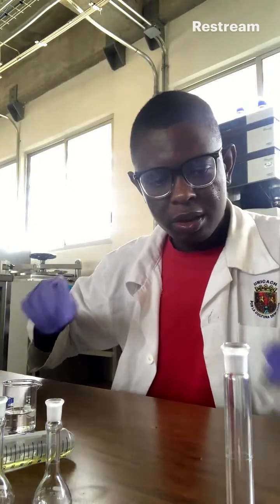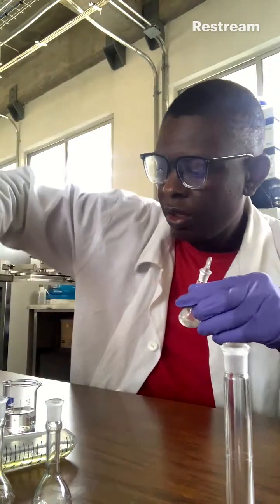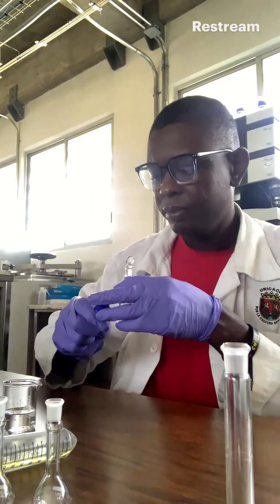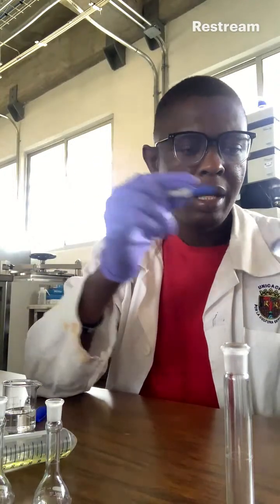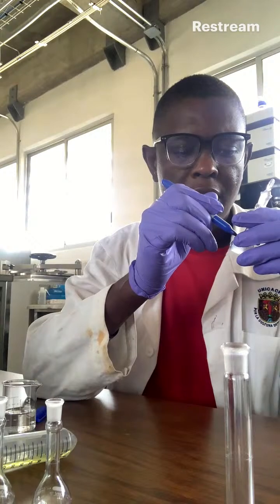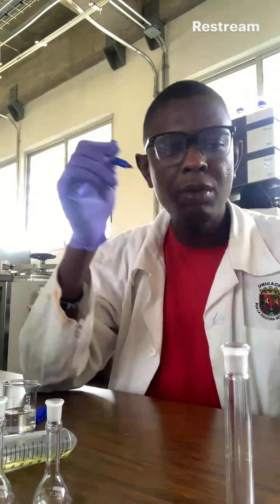Oh, sorry, this is not GC agave. This is GC sodium aluminate, GC NaAl.